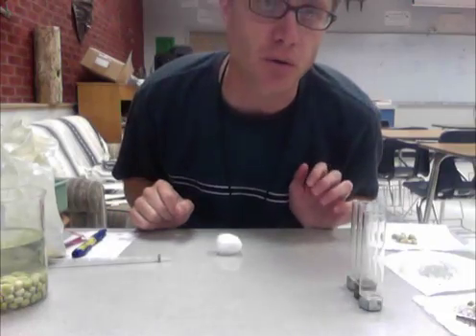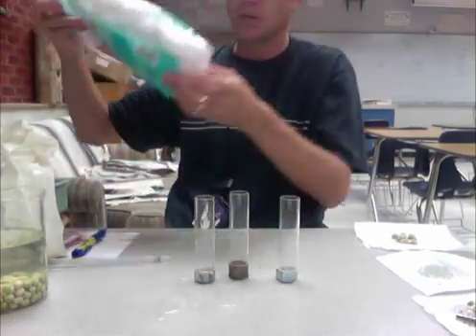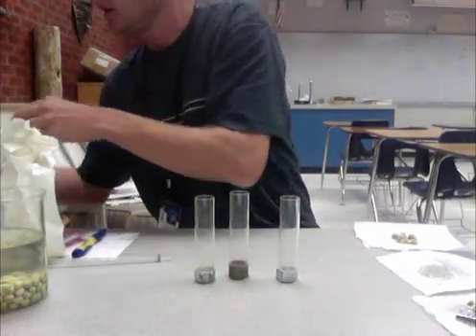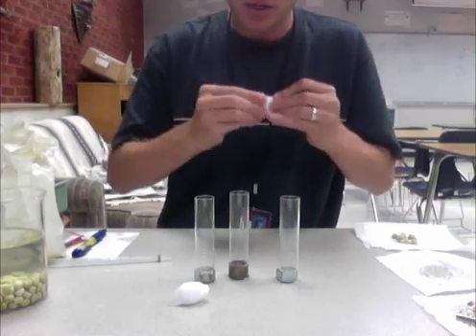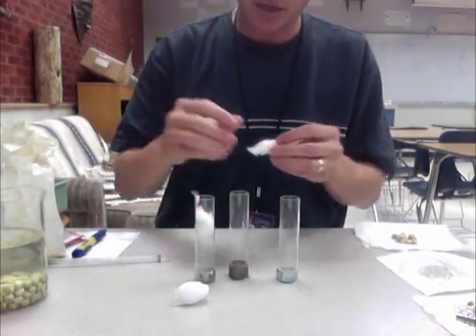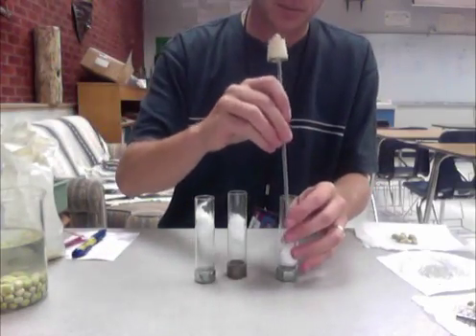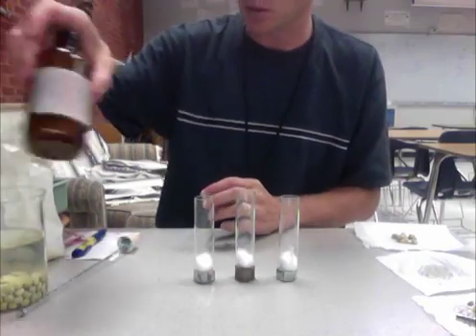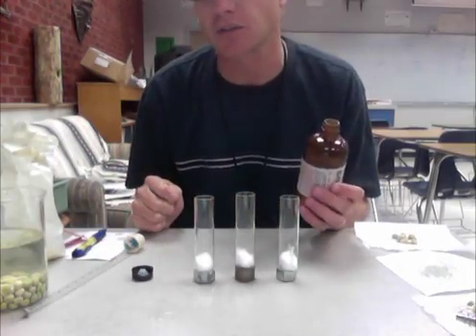Now I have to actually make the respirometer. I've got these three vials. I'll take one cotton ball, rip it into three equal bits, and stuff one piece down into the bottom of each respirometer. The pipette can be used to push the cotton down. So now we've got absorbent cotton on the bottom — absorbent means it soaks up liquid.